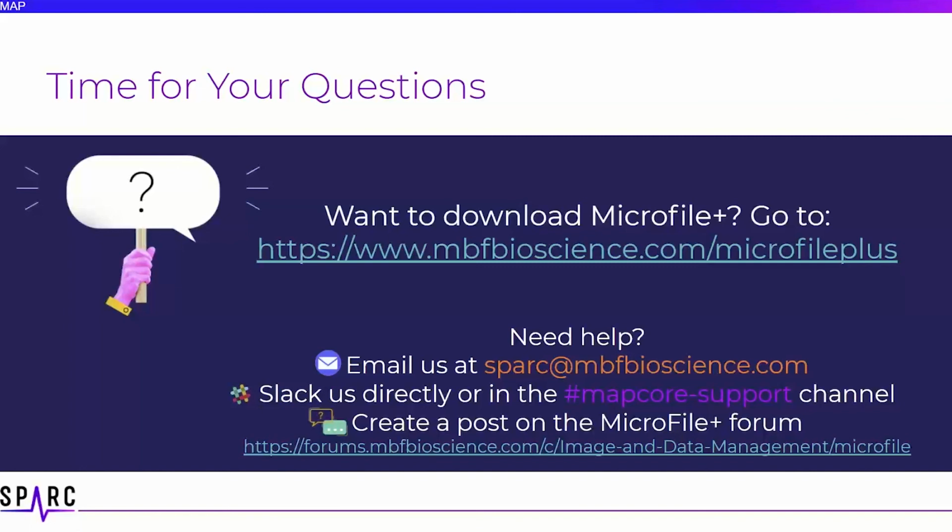Thanks, Macy. It looks like we do have one question so far. I'll read that off, and maybe you can take that, Macy. The question is, if I have pictures of my experimental protocol of sample preparation, for example, do these images need to be converted and abide by the SPARC image standards? No, they do not. Only what's considered the source microscopy data that you use for analysis. So not ancillary supporting images for documentation or things that you would normally put in a publication. Just the data products suitable for analysis are covered.